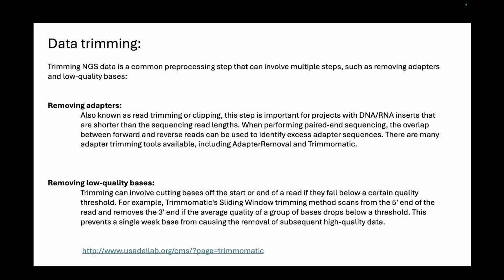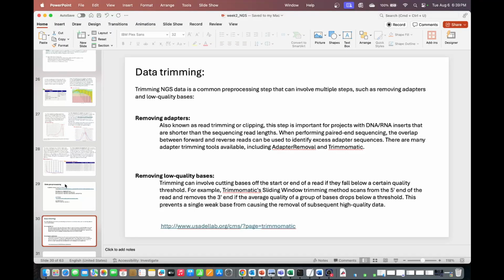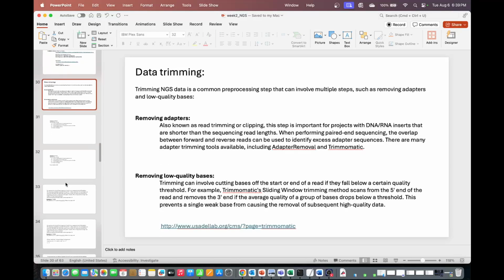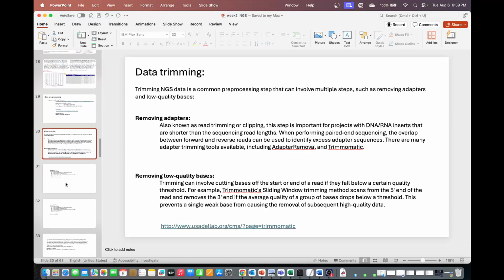After this we'll come to the next part in the next week. We'll do variant calling. You'll identify what the different variants in the genome are, what the single nucleotide variants are, what the structural variants are, what the different types of variants present in the genome are. So till this part was identifying the different data formats and using quality control to basically clean up your data. That is all. So this was the revision for the second week.